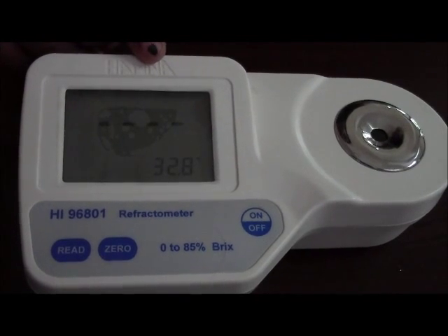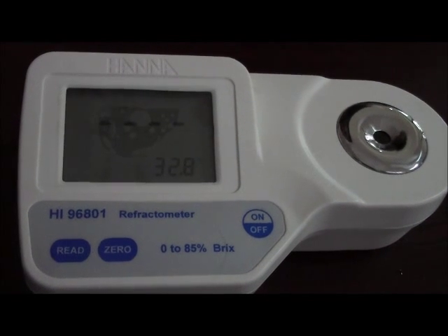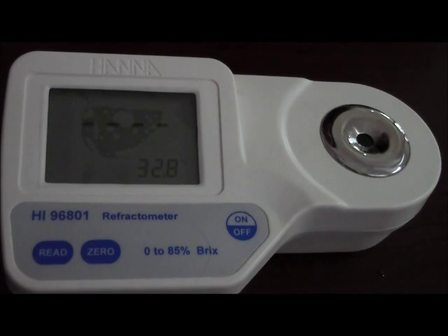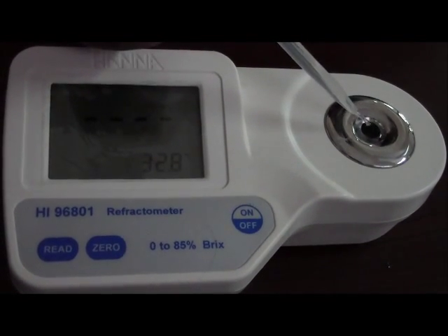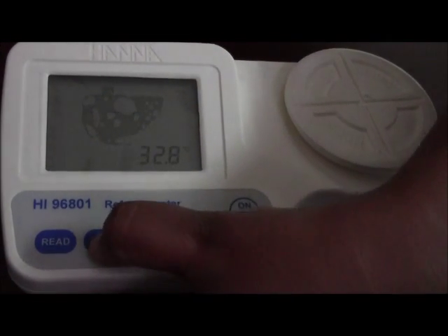The 100% indicated shows that currently the battery is 100%. We would calibrate the instrument now using distilled water. Add a few drops of distilled water and cover it with a lid. Zero it.